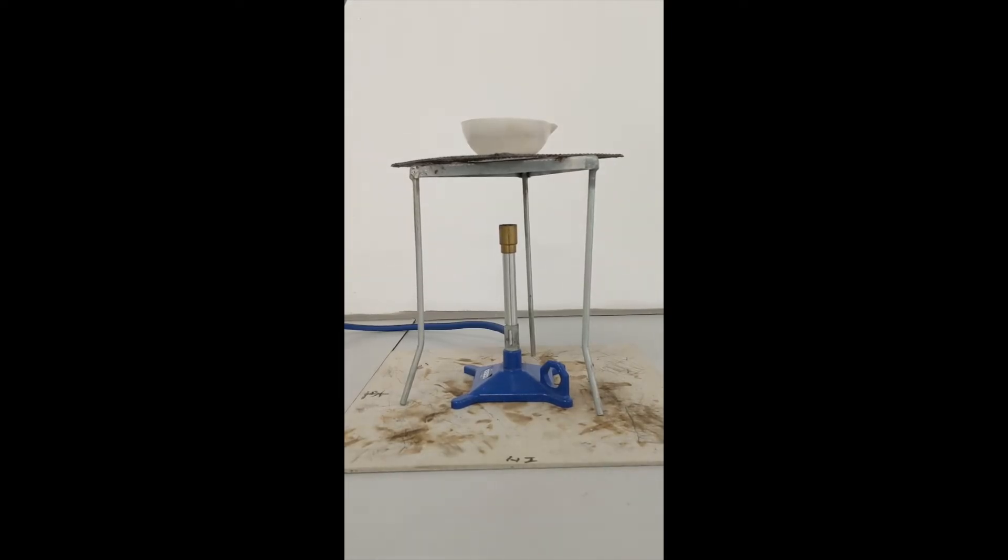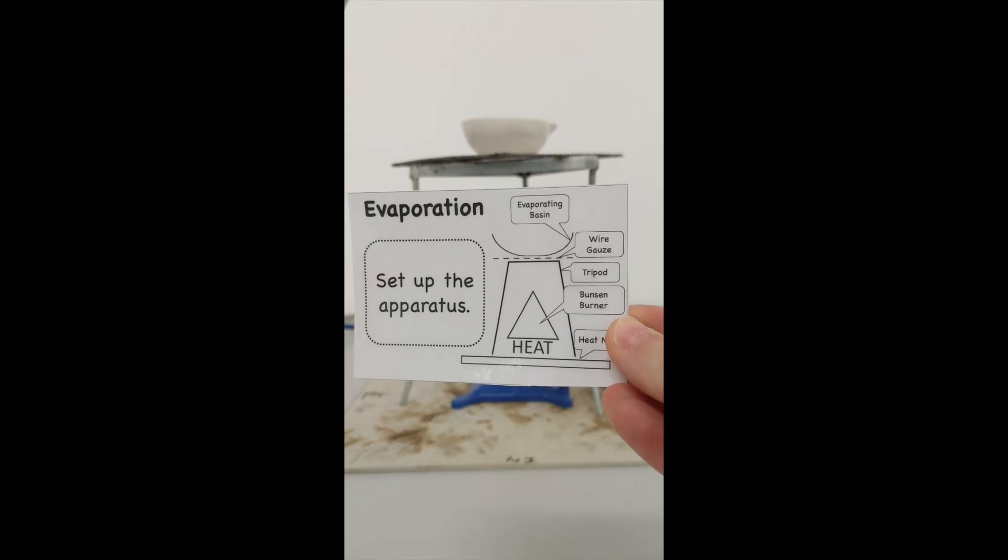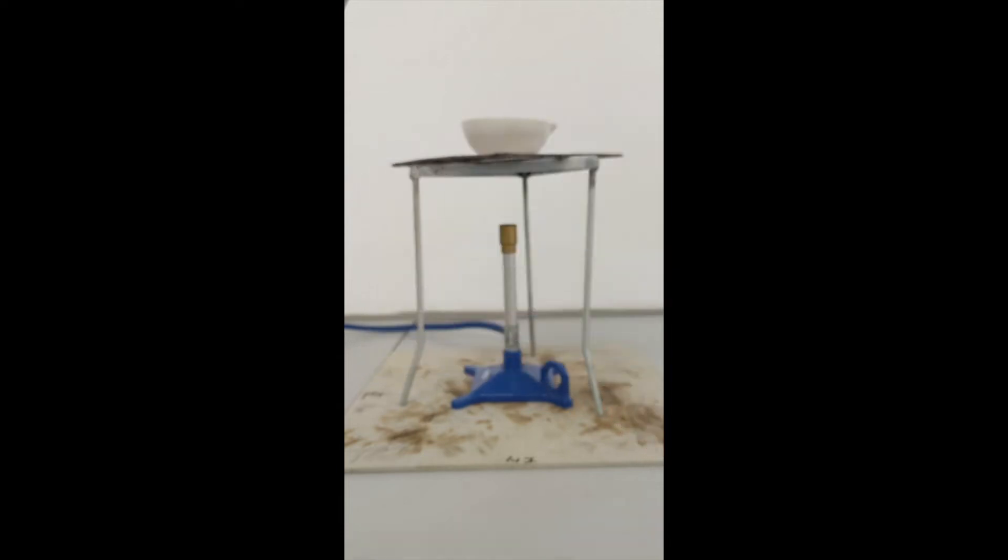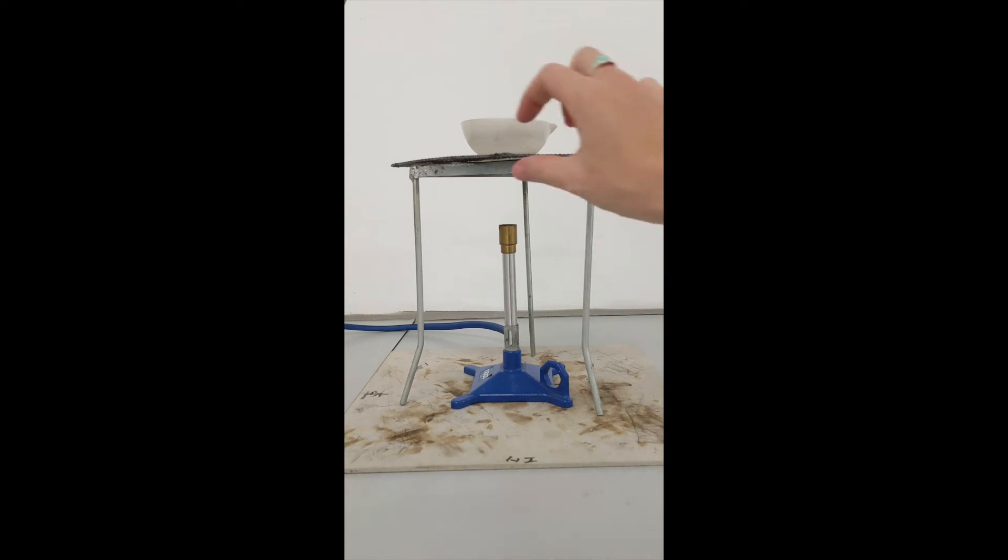Now we are ready for evaporation. We are going to set up our apparatus just like in the diagram: heat mat, Bunsen burner, tripod, wire gauze, and evaporation basin.